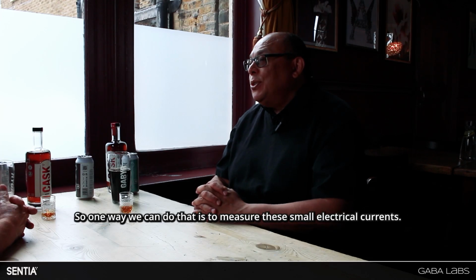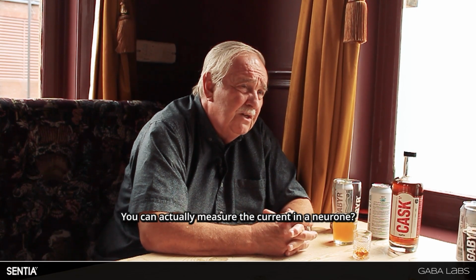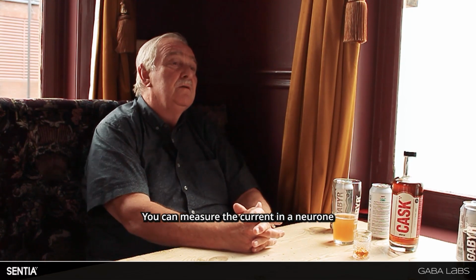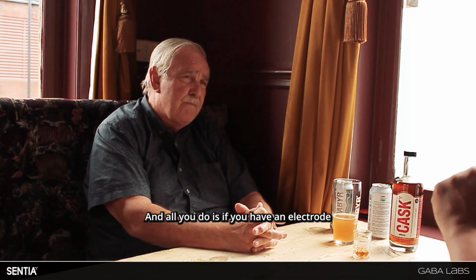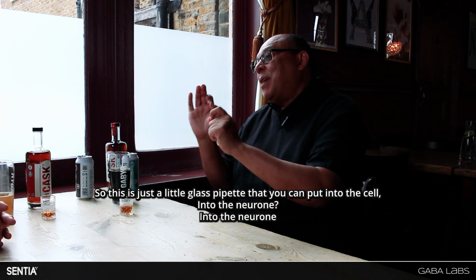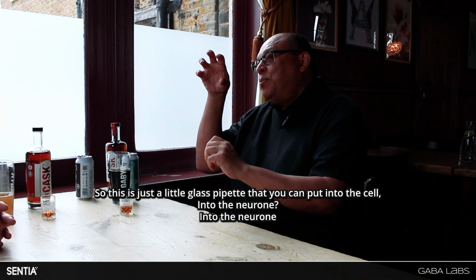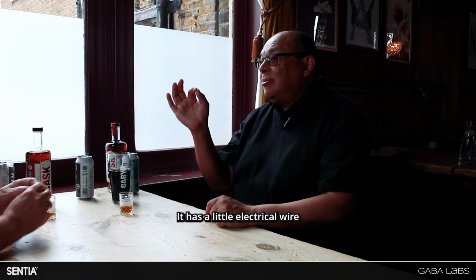So one way we can do that is to measure these small electrical currents. You can actually measure the current in a neuron, and all you do is, if you have an electrode, so this is just a little glass pipette that you can put into the cell. Into the neuron. It has a little electrical wire.